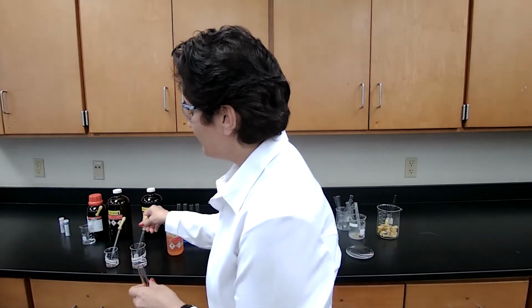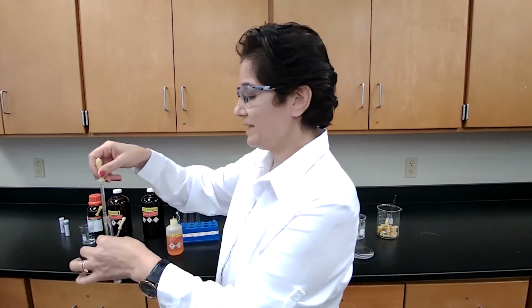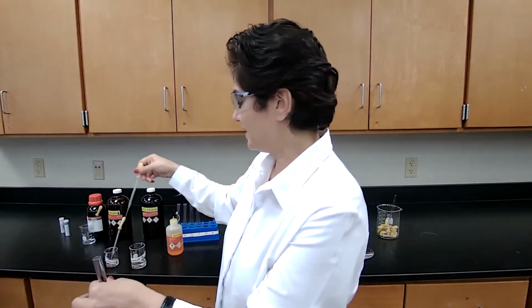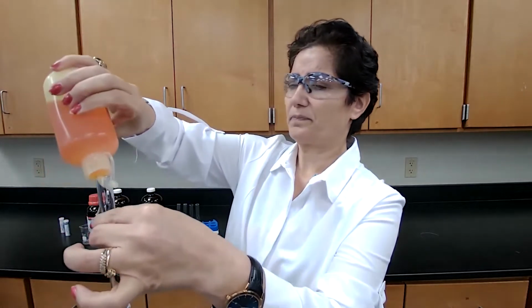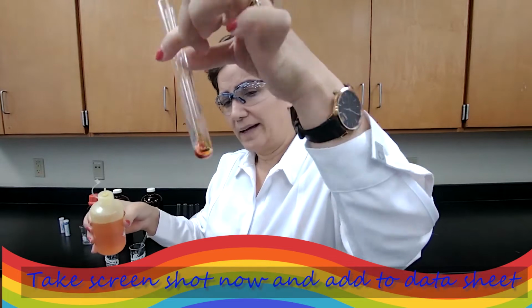All we have to say is alcohol or not alcohol. This is the unknown A plus the ceric nitrate.